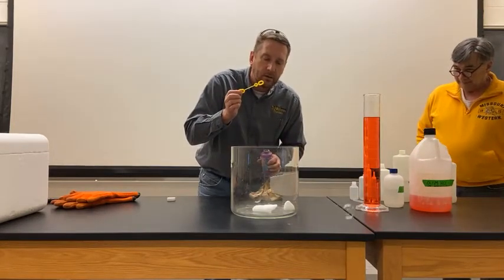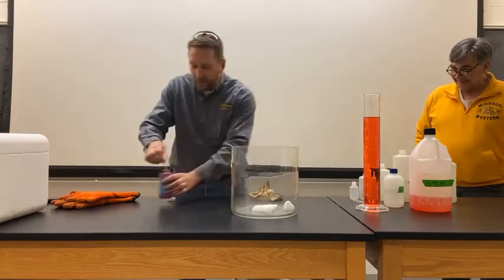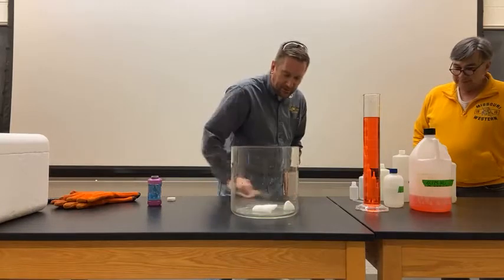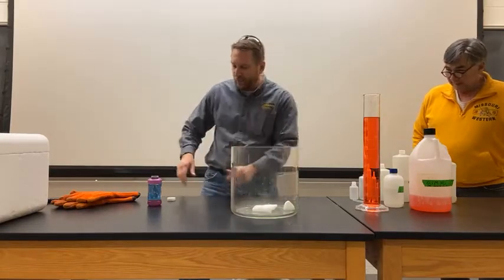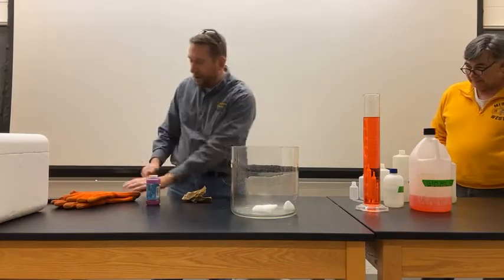Yeah, it's in there. Okay, so we clearly need to have some more CO2 in there though, because that bubble made it all the way down to the bottom. So our container isn't filled with carbon dioxide yet.